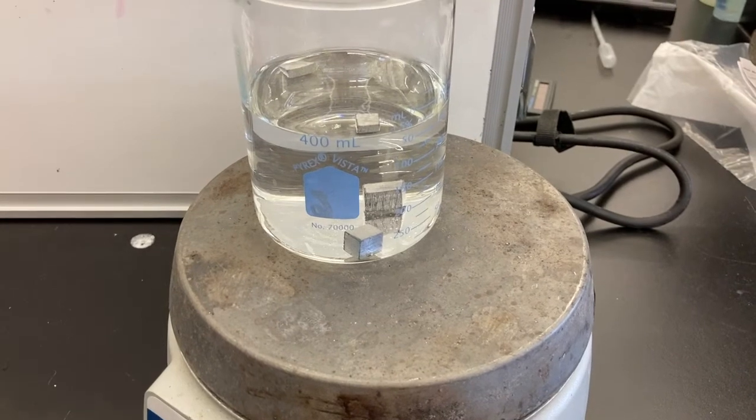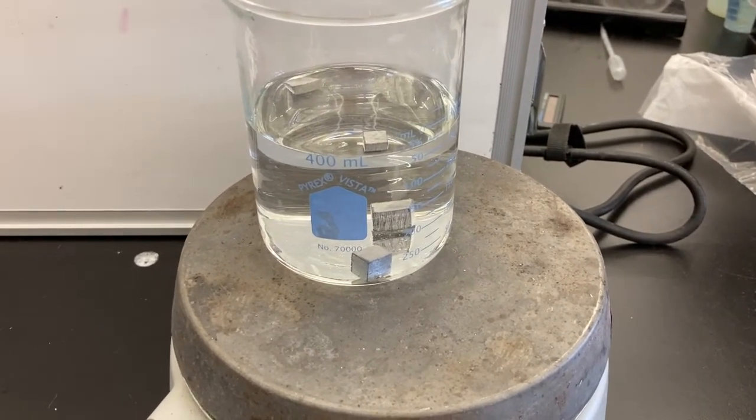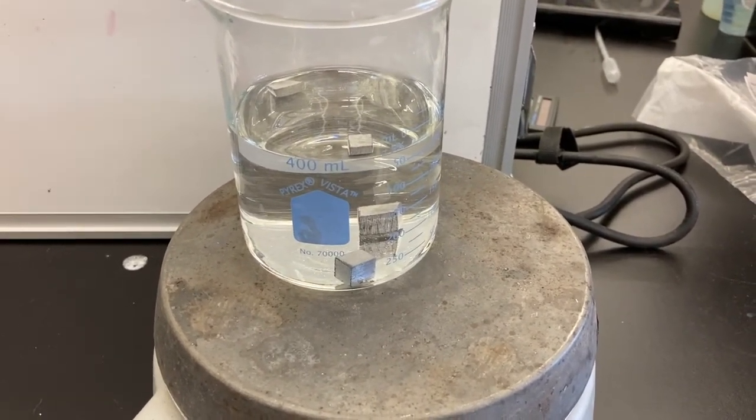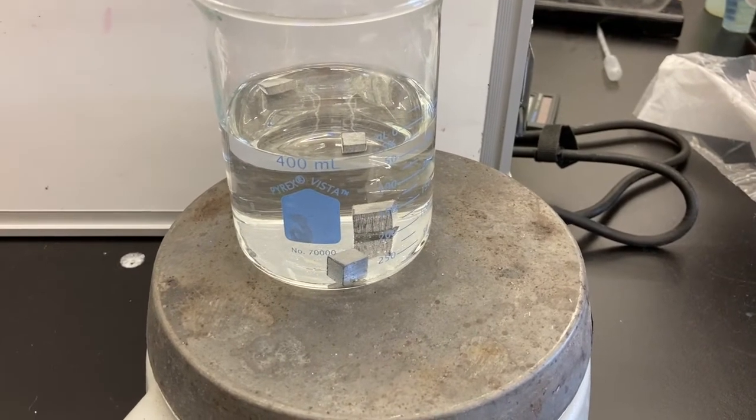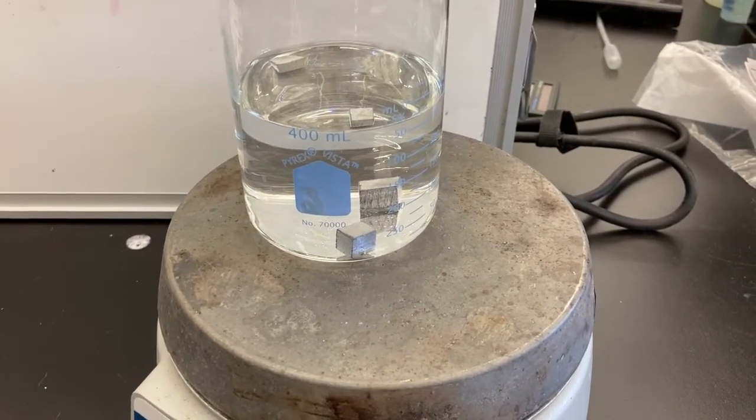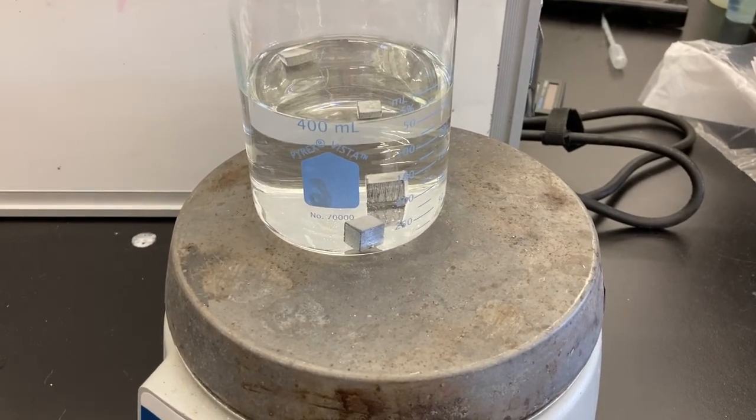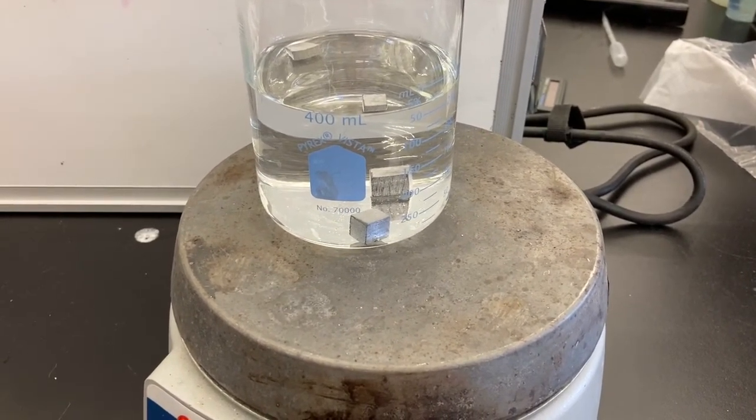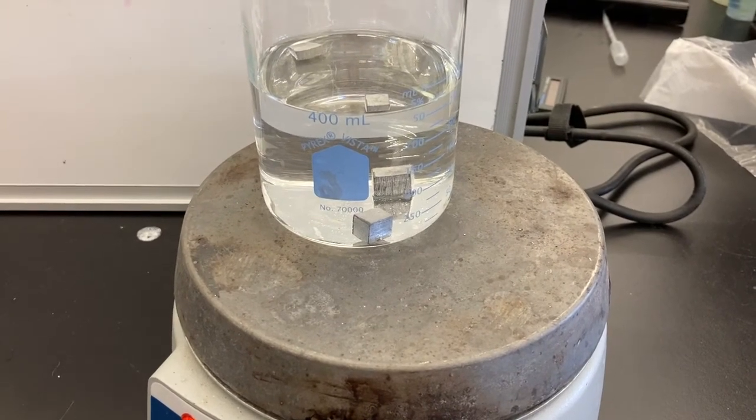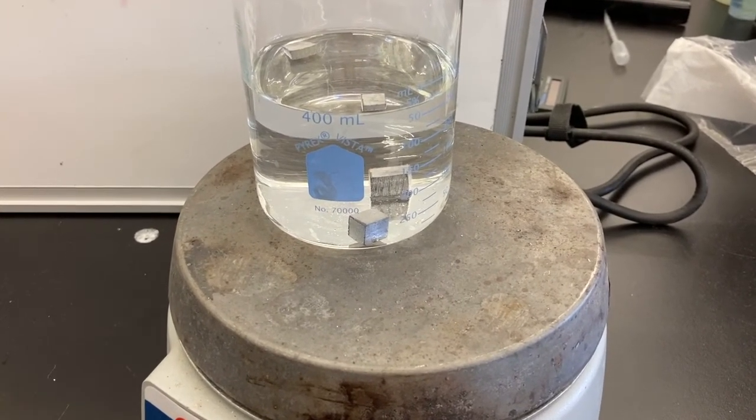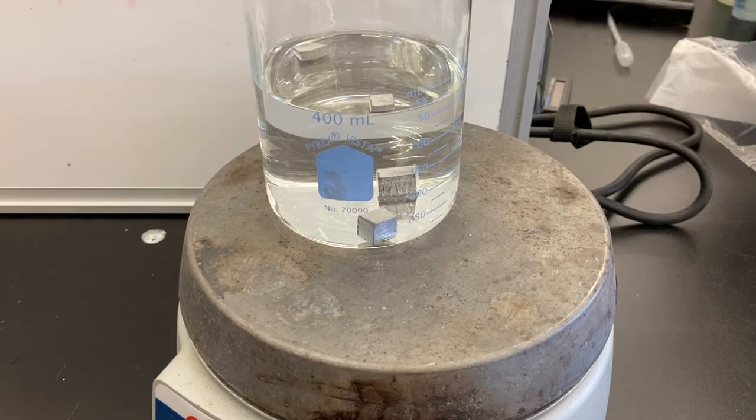After you have filled your 400 milliliter beaker about halfway full with water, this can be tap water, you can add your metal pieces. Now if you want to add both at the same time, you need to keep track of which one is which so that you know which mass goes with which piece. You can always re-weigh them after you do your experiment as well if you are uncertain.